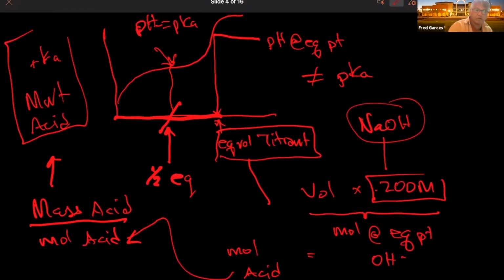That's what we try to instill in terms of your lab technique, to not only look at the data, but look at the precision and the reproducibility of that data. Anyway, this right here is how you nail down your unknown, through the Ka and the molecular weight.